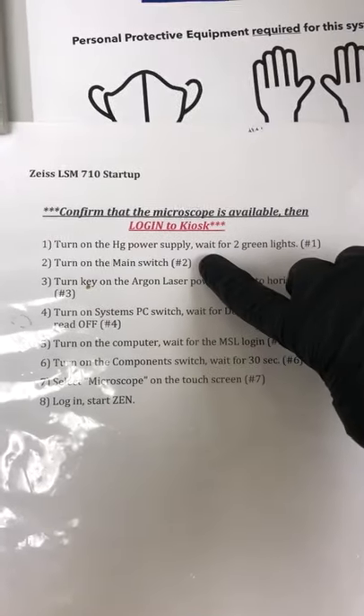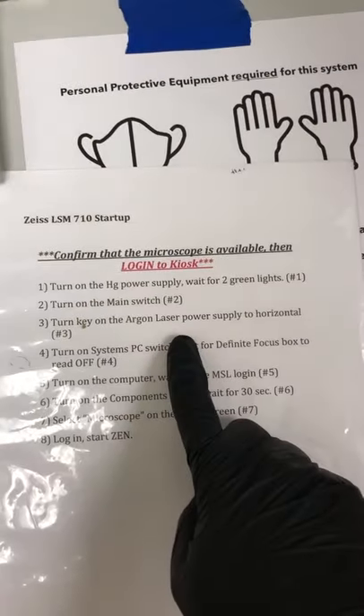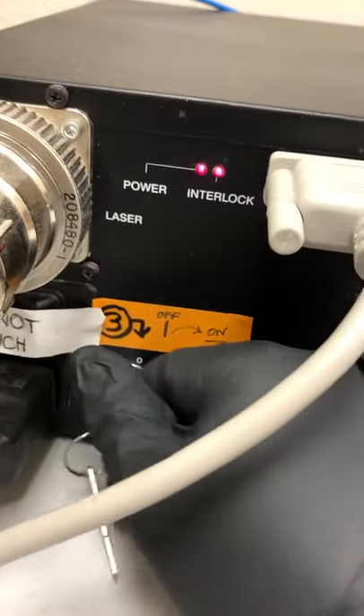The next step is to turn on the main switch — that's number two. The third step is to turn the key on the argon laser power supply to horizontal. You can see it's this.